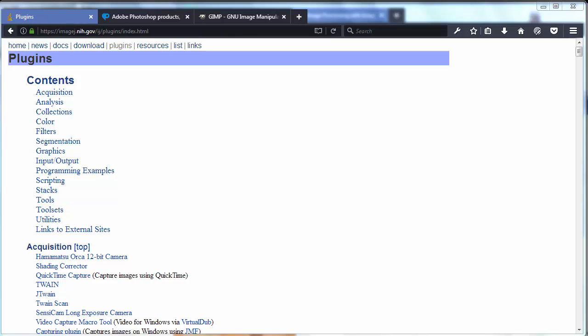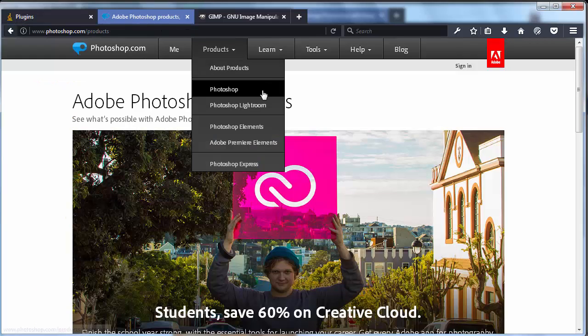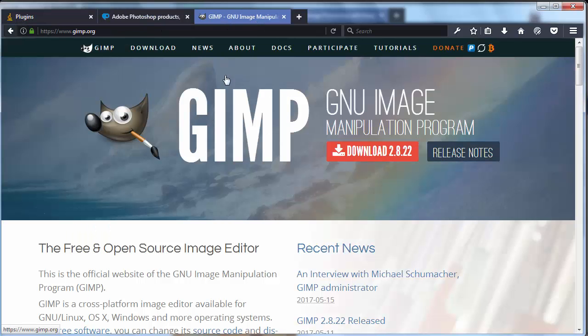In ImageJ you have functions for a great variety of common tasks and you can extend these functions with plugins or macros. ImageJ is not a replacement for Adobe Photoshop, Gimp or any other graphic editing program.